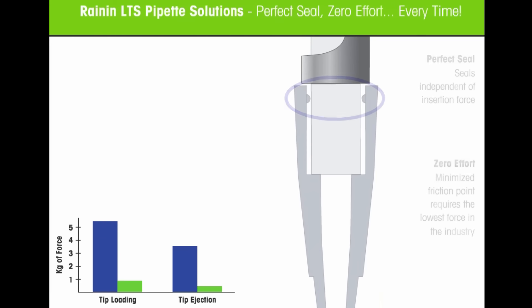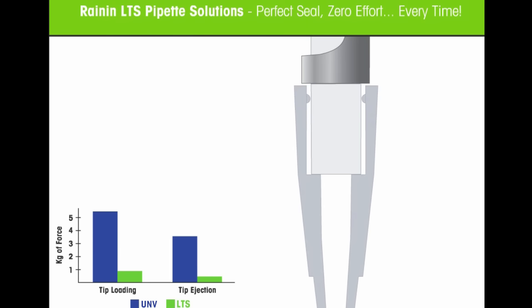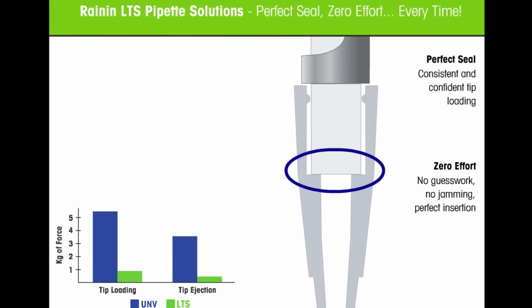LTS dramatically softens the forces required to load and eject pipette tips, and delivers confidence in a perfect seal. The Rainin LTS Light Touch System creates a strong, reliable seal with astonishingly low force.